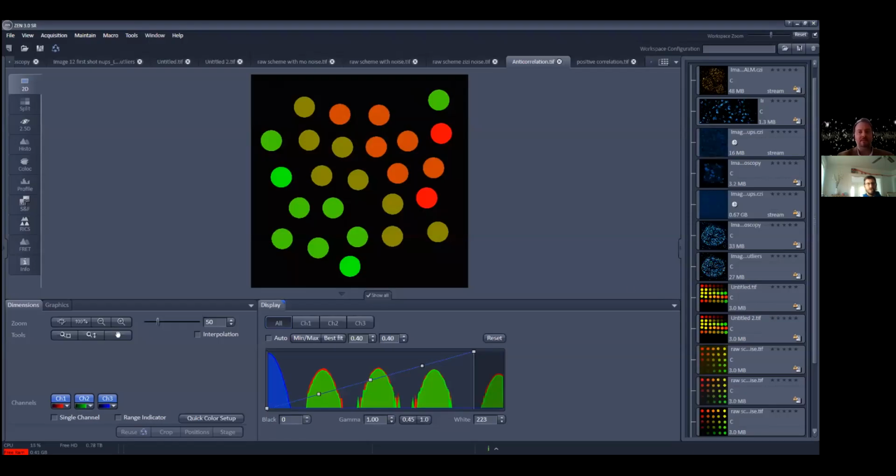So, yeah, without further ado, let me switch to my ZEN screen and show you the tool. Oh, hold on. Do I have to click anything here to share the screen? Yes, here, share screen. There it is. Then share. So you should be seeing this. Yep, looks good. Bunch of dots.